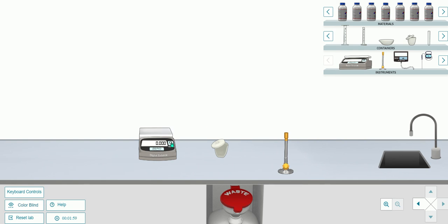Don't forget the unit. That's something that I use to grade on the rubric. My grading rubric includes whether you've been using units consistently throughout the entire lab that you turn in. So I want to see all those units. Other than that, there shouldn't be anything too tricky or special about this lab. You're just heating that malachite.